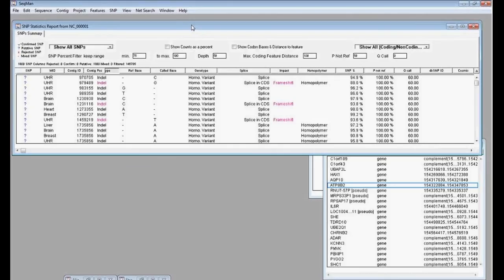Great. And then another question about SNPs. You talked about using the filter to show only annotated SNPs. Is that only available if you use the genome template package, or in what cases do you have that option? It's available when your reference sequence has an annotated SNP in it, or if you use the reference package that has a dbSNP database. If you don't have a dbSNP database, then your reference sequence must have an annotated SNP.